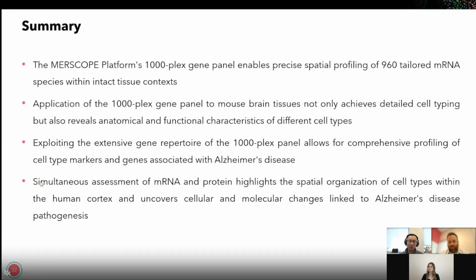But in most cases, we still rely on those transcripts adjacent to the soma. If we look at the transcript density, most of the transcripts are actually located adjacent to or in the cell soma. So there's not much information loss in normal brain data.